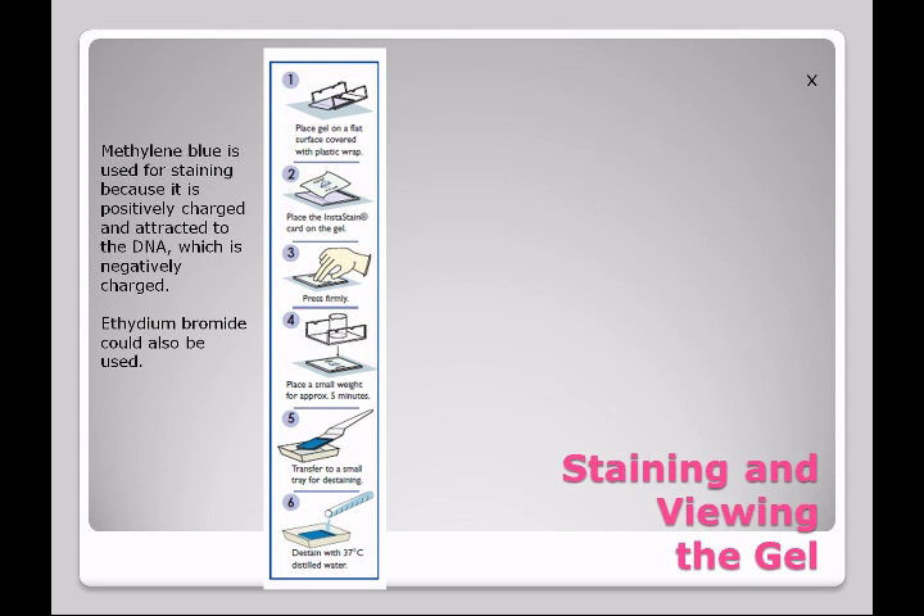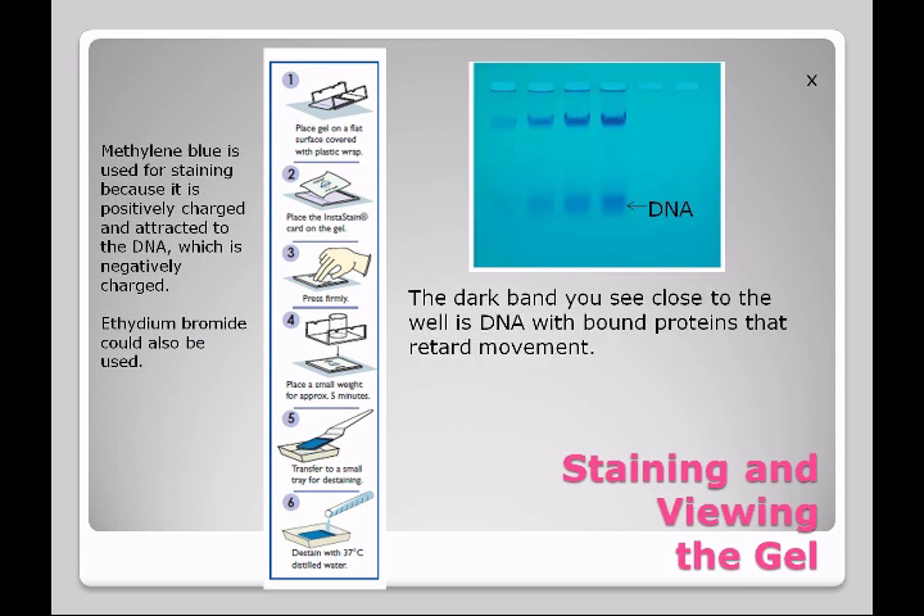Most likely I will be doing this staining for you because lab will probably be over. When you come back to lab the next time, you're going to look at your gel. The dark band close to the well is DNA with bound proteins — because the proteins weren't destroyed and stuck onto the DNA, it was quite heavy and couldn't move through the gel. However, the DNA you see further through the gel is what you expect to see, and this DNA has moved through as one big clump. Now, when we do a DNA fingerprint, we see bands of DNA and not this smear. Why do you think that's so?